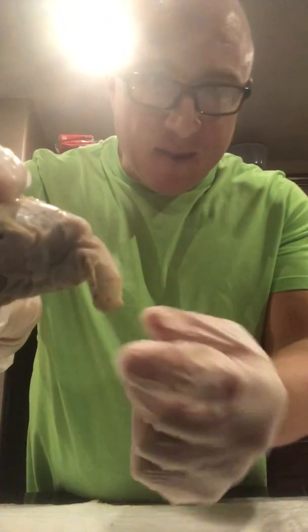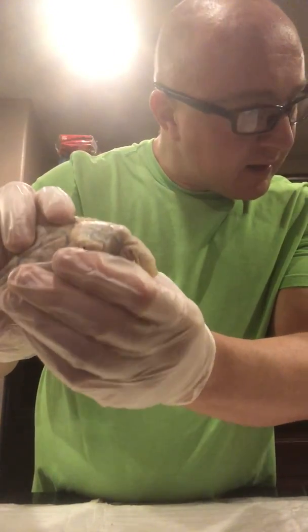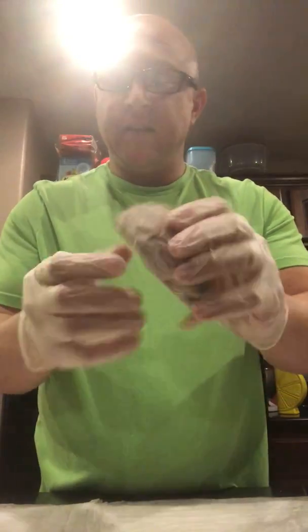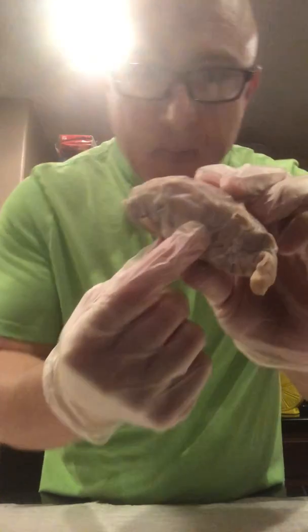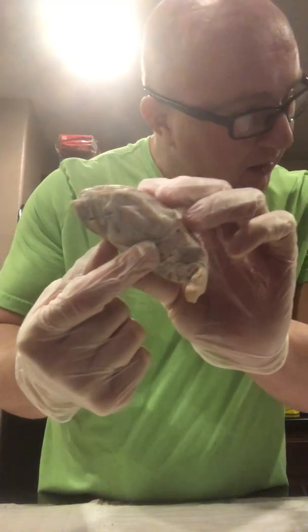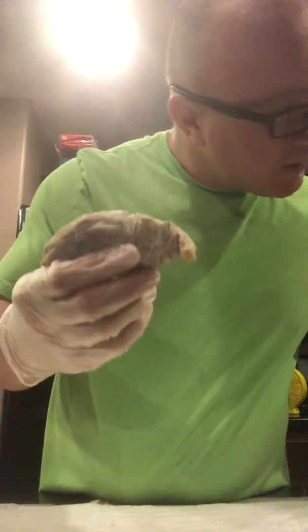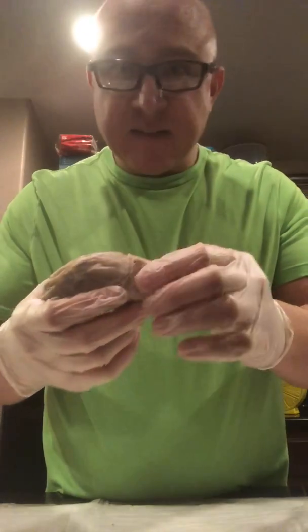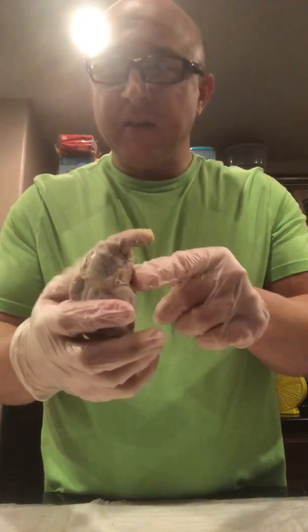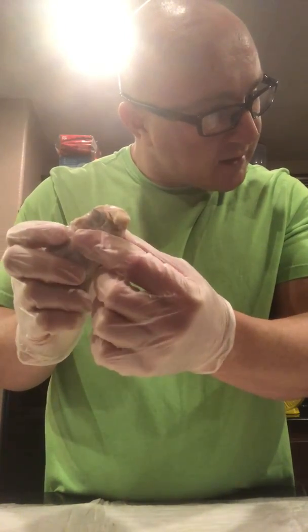The brain stem here. The midbrain is roughly here. It's going to be right above the pons. The next was the cerebral peduncle. That's going to be lateral to the sides of the midbrain. So both sides of the midbrain is going to be the cerebral peduncle.